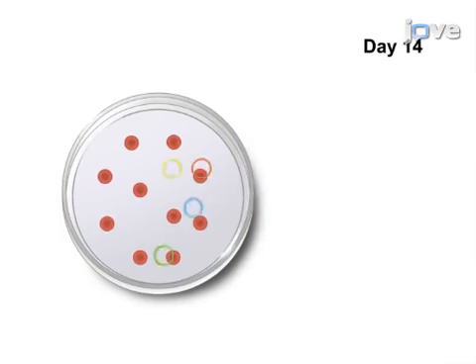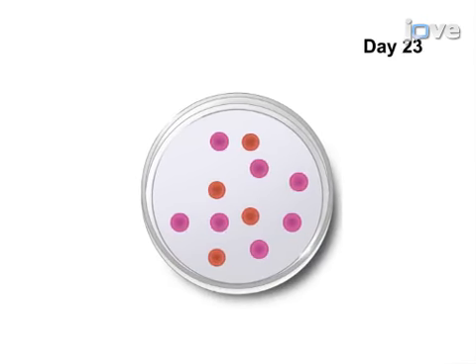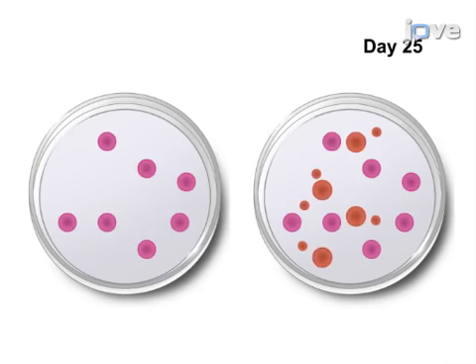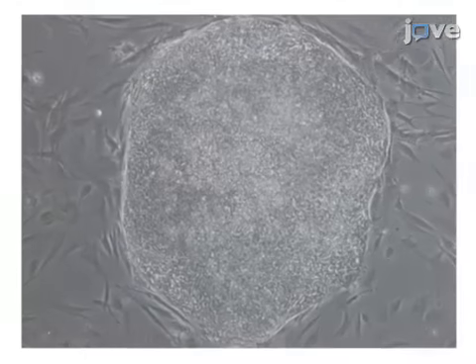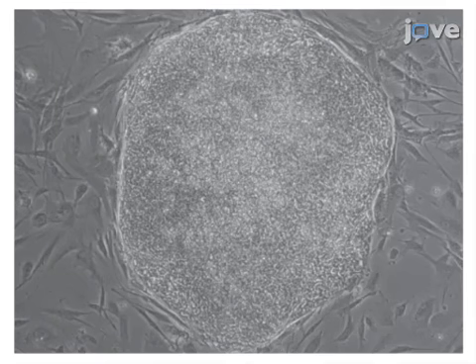The second step is to transfect the Buffy coat PBMNCs with episomal plasmids by electroporation. The transfected PBMNCs are then plated onto fresh mouse embryonic fibroblast feeder cells. The final step is to manually pick induced pluripotent stem cells from the culture and transfer them onto new feeder cell plates for expansion. Ultimately, the efficient reprogramming of PBMNCs into induced pluripotent stem cells with a typical human morphology can be shown by immunofluorescence and measuring gene expression.